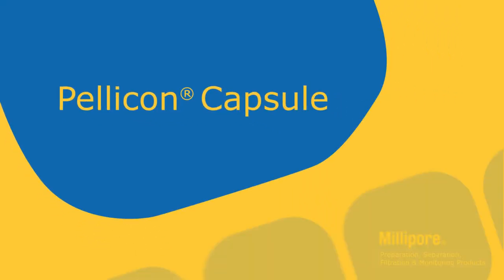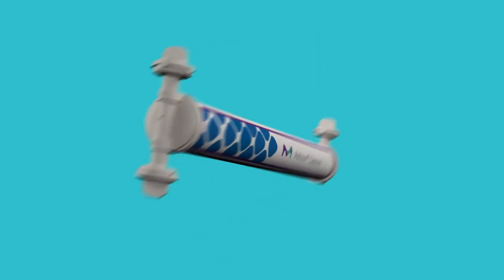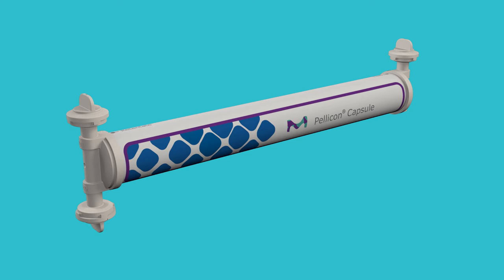Introducing our innovative Pelicon capsule. The Pelicon capsule is the first of its kind — a true single-use tangential flow filtration filter to streamline your bioprocess.